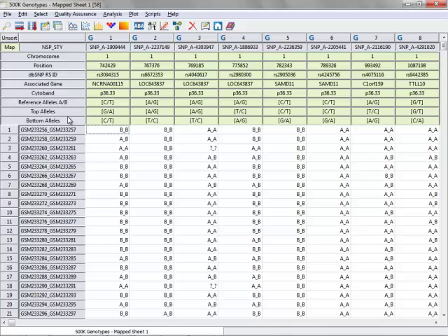I can right-click on that map button and uncheck strand, and that will hide the strand. But as we just previously chose, every time you apply that particular marker map to the spreadsheet, those particular marker map fields that we selected will be visible.